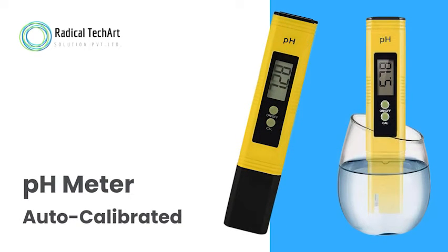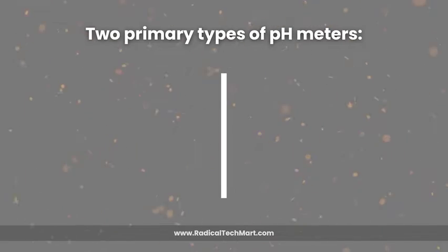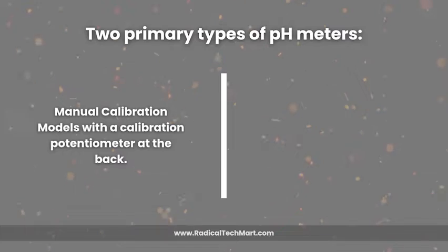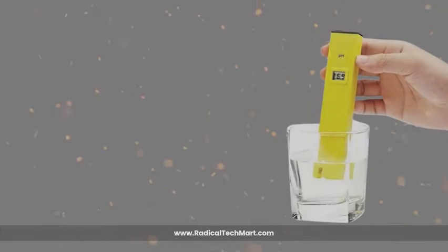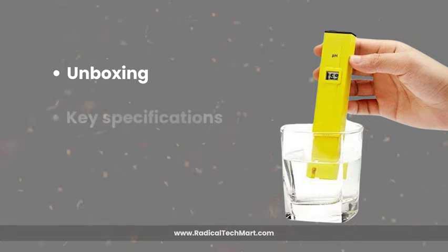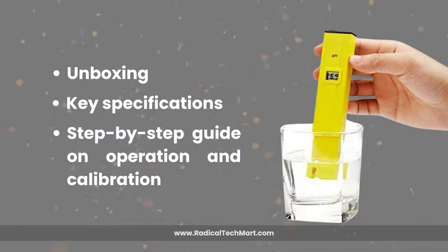Today, we are excited to introduce a versatile tool, the auto-calibrated pH meter now available in the Indian market. In general, there are two primary types of pH meters available: manual calibration models with a calibration potentiometer at the back, and advanced auto-calibration models that simplify the calibration process. In this video, we'll cover unboxing the auto-calibrated pH meter, its key specifications, and a step-by-step guide on operation and calibration of the pH meter.